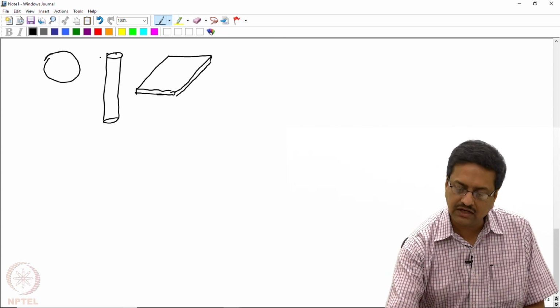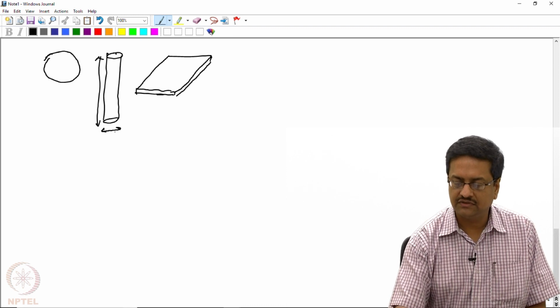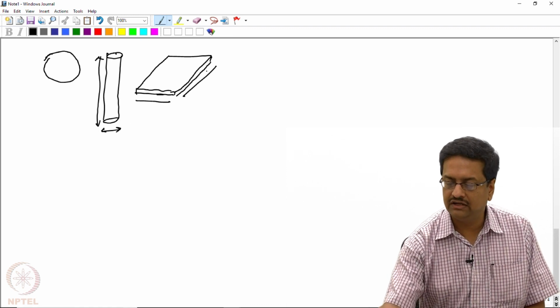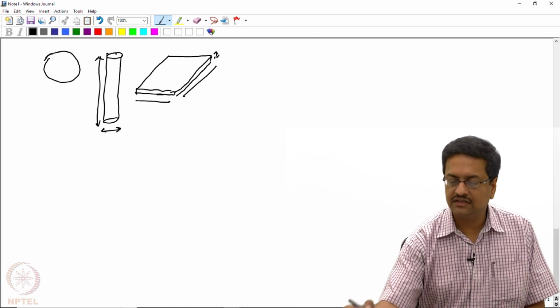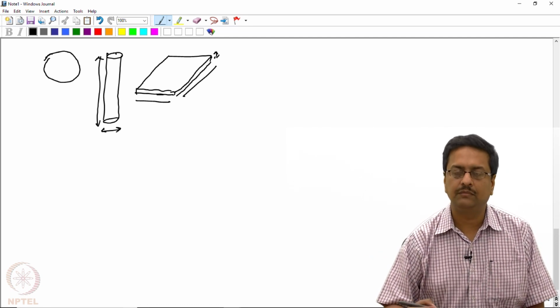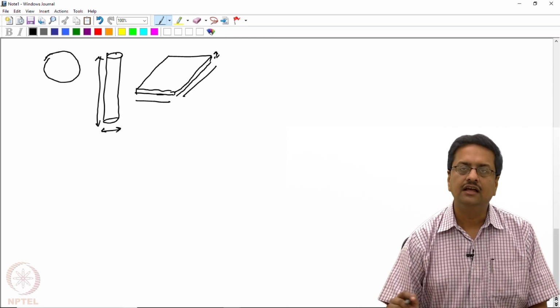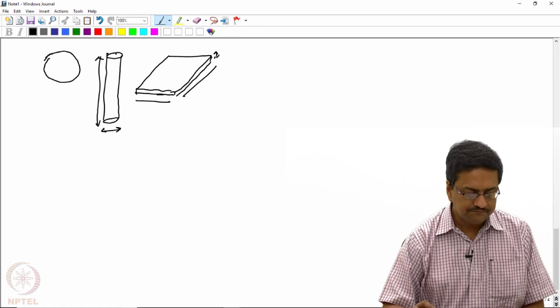One should be able to find out the actual length, width and thickness of the crystal, and then with that information one should be able to apply some theoretical or calculated absorption corrections in the data that is collected.